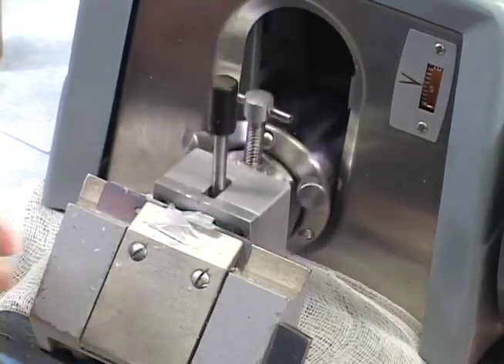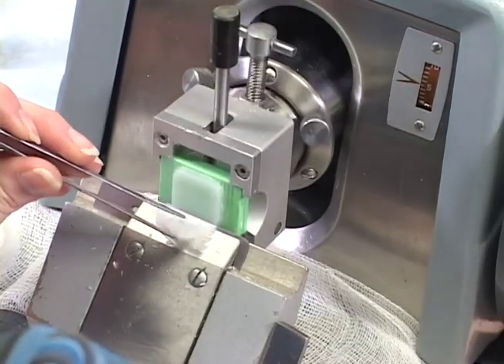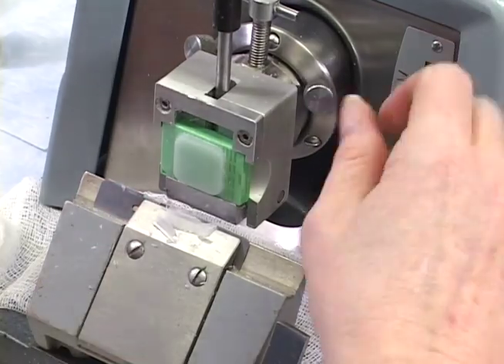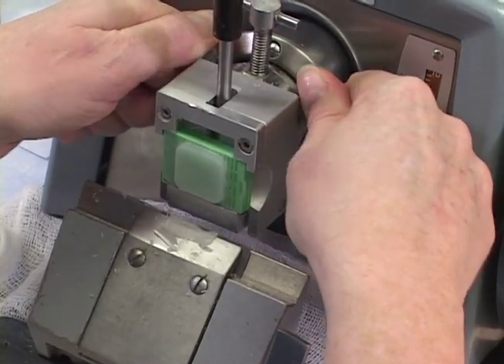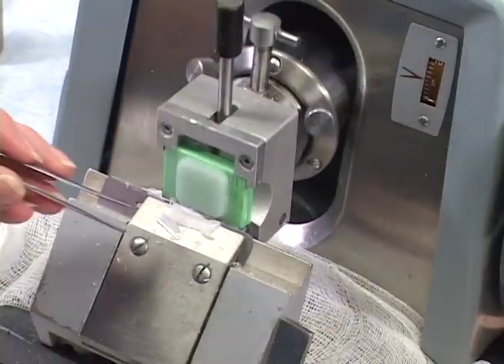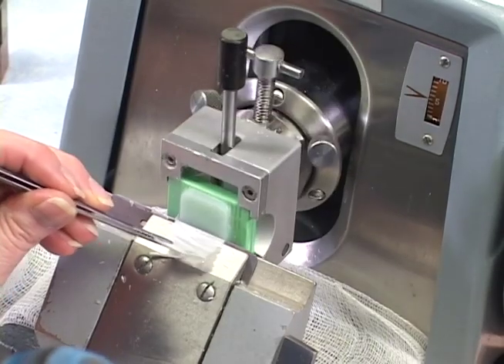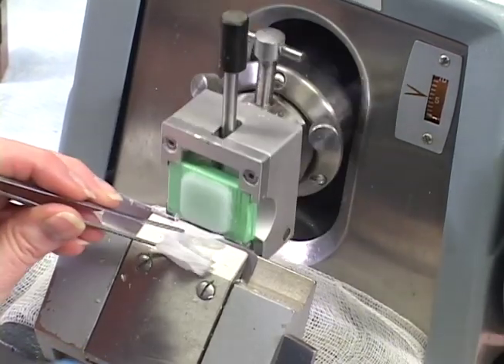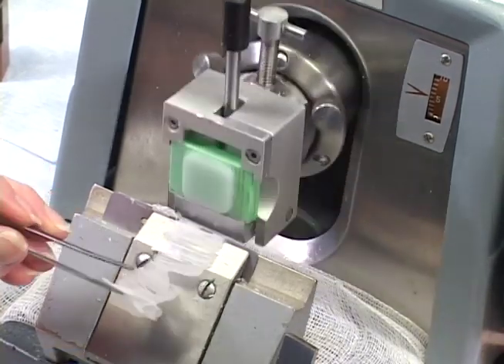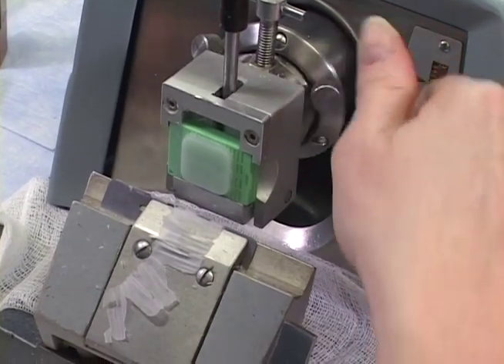I just want to get this lined up nicely again. I can see that it's been adjusted over time, that it's not as even as I would have liked it. So I'll give it its adjustment. And just get it back to what it was. Even though it was cutting a nice ribbon, it would be nice to have it aligned to make a really nice, pretty even block face.